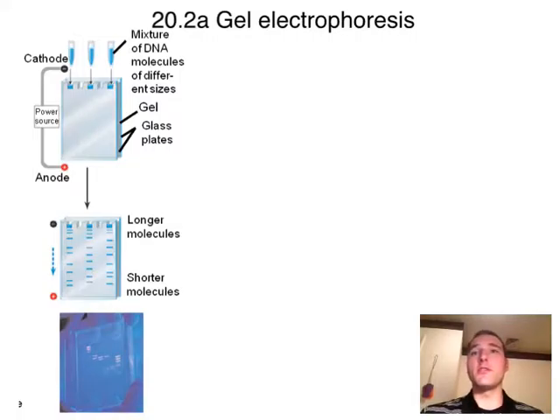Or maybe we did PCR technology, and we've got basically a little tube full of all kinds of nucleotides and partially completed lengths of DNA that we're looking for, and then also some of the DNA that we hoped to amplify. So one of the ways that we can identify the particular segment that we want and study it in whatever way we want to is through gel electrophoresis.